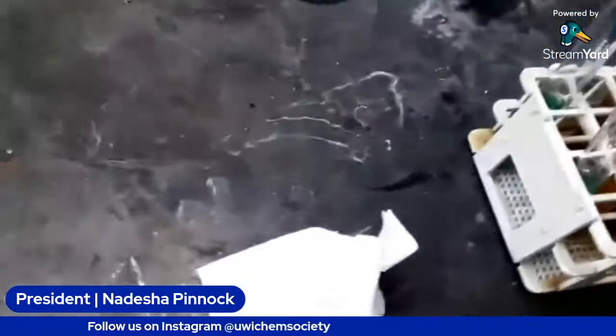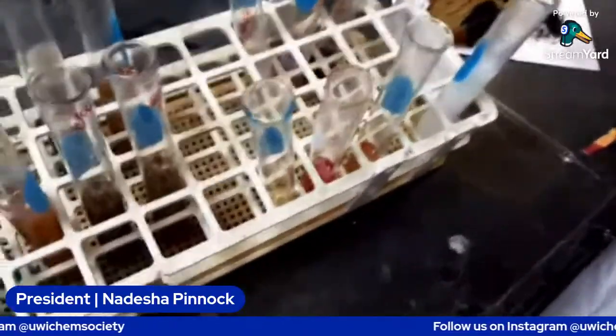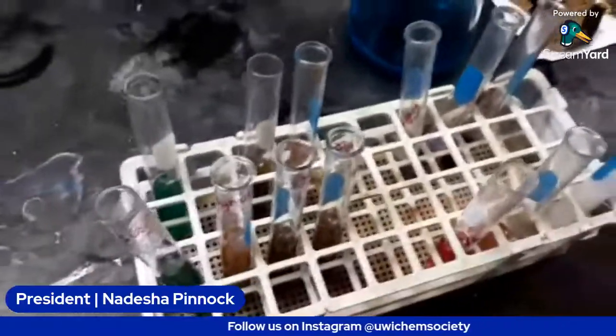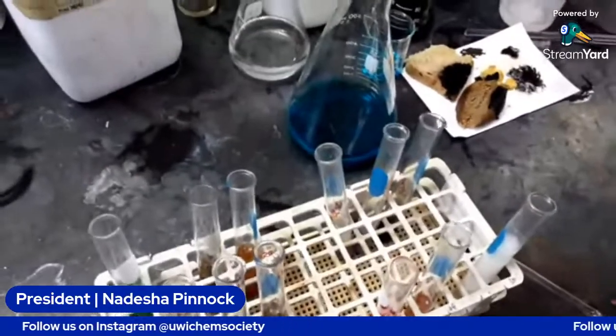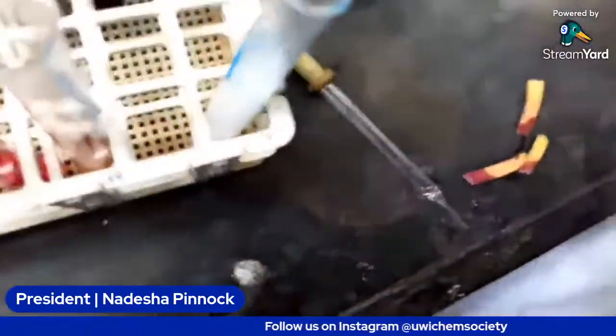That's also acidic. All right, so all three of them are acidic.